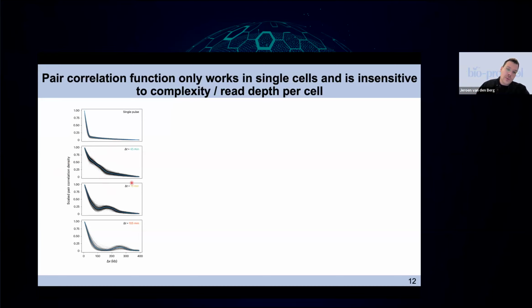However, if we do this with 75, which is 60 minutes because it's the distance between the middle of the labeling, so it's 75 instead of 60, you now start to see a very defined hump in the histogram of distances. Similarly, if we increase the time to even longer, we see this shifting even further to the right, indicating that we're capturing these forks in the process of their copying.